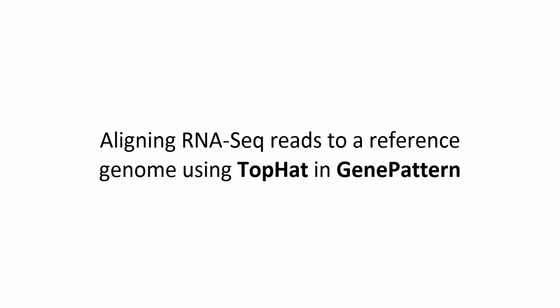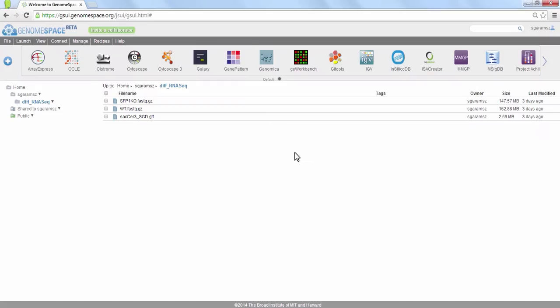Hello from GenomeSpace. In this video step, we will use the GenePattern tool to align RNA-seq reads to a reference genome using the TopHat module.